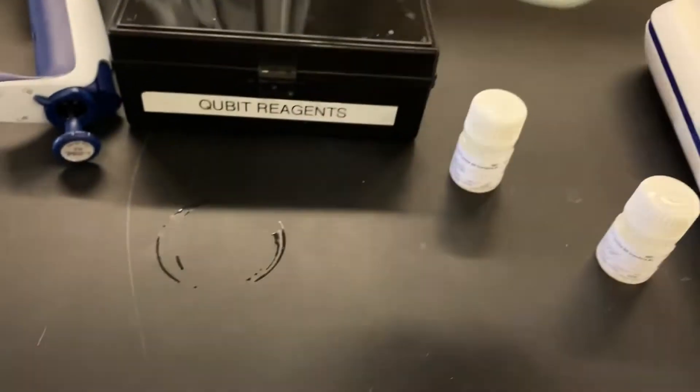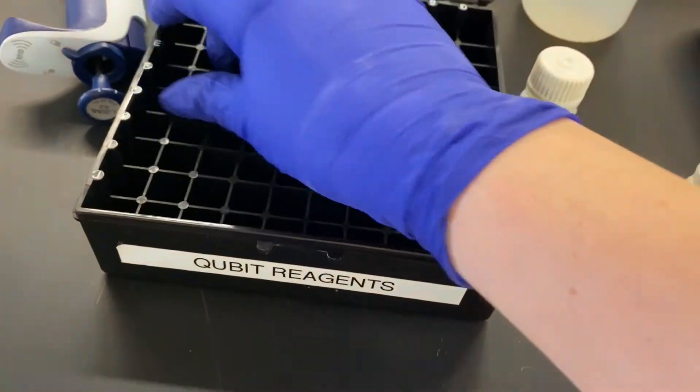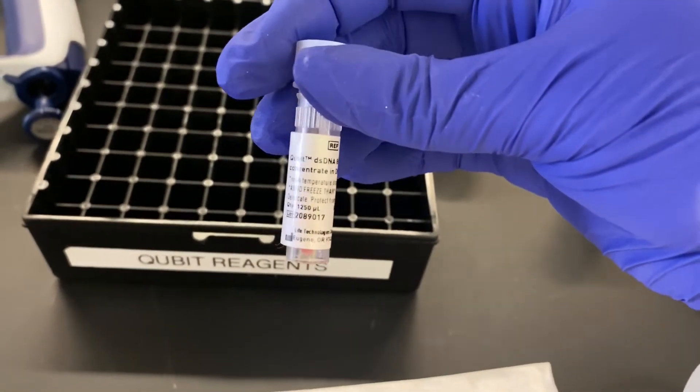To make the working solution you'll need the appropriate buffer and reagent. We keep the reagent in a dark box to prevent exposure to light. Make sure you double-check the label on both the buffer and the reagent to make sure you're using the appropriate solutions.